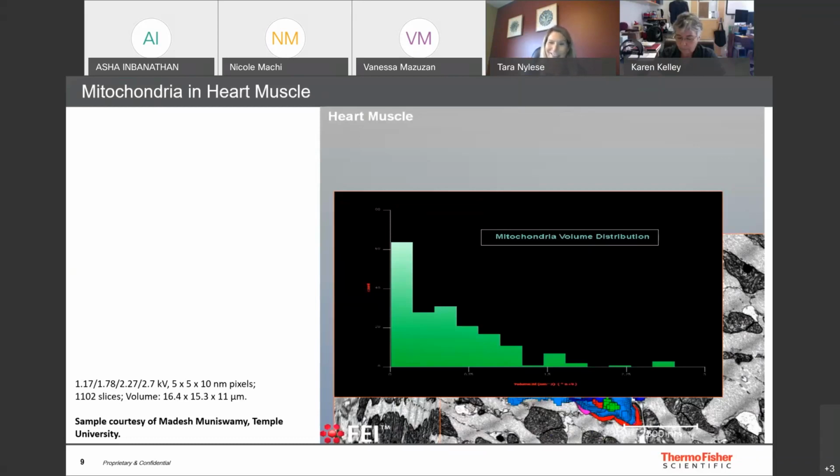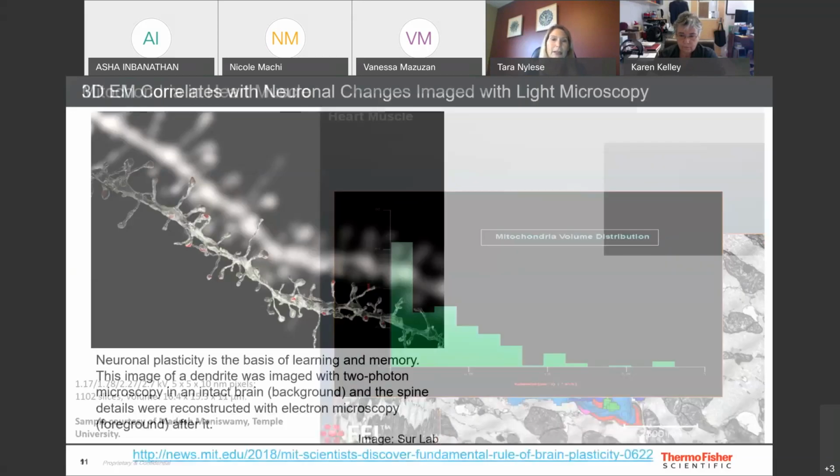I remember when the scientist, she actually used that word. In the diseased cardiac tissue, the mitochondria are puffed up or inflamed, slightly larger. So each mitochondria has a larger volume fraction. And when you compare the diseased tissue to the healthy tissue, you can see that there's a small difference in volume fraction for individual mitochondria as well. And, you know, of course, that makes sense. Inflamed mitochondria, they're working overtime to help compensate for the cardiac muscle.